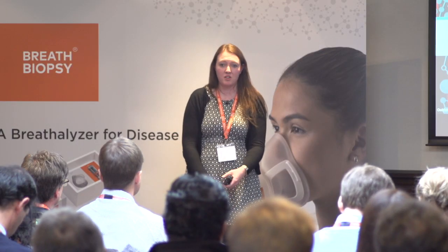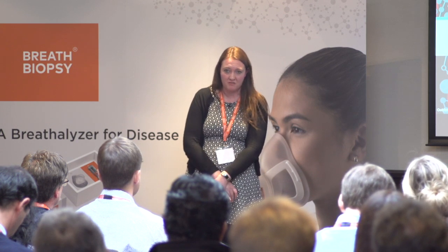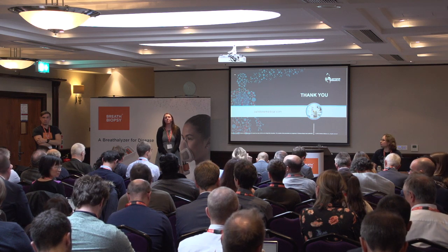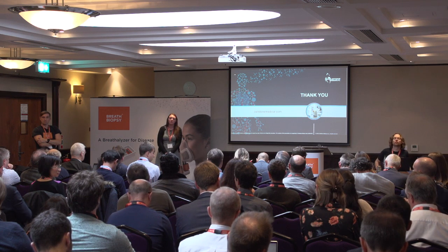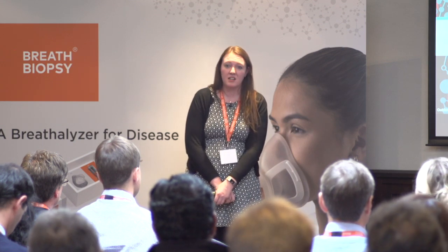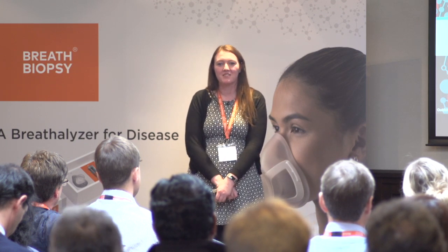So to quote what we're using at the moment, we're using a mass range of 30 mass to charge to 450. For further info on how to push that, I'd advise speaking to Christian. Okay, so the detection limit of the method that you are using with the library of molecules. Okay, so far the smallest molecules are probably pentane and acetaldehyde. We've not tried lower than that at the moment. Okay, thanks.